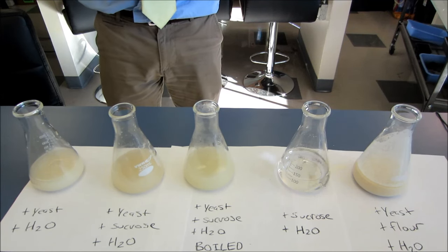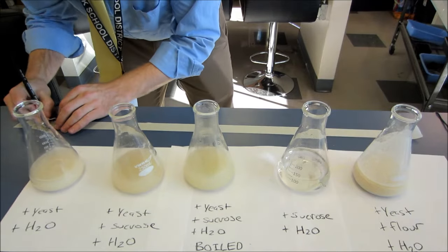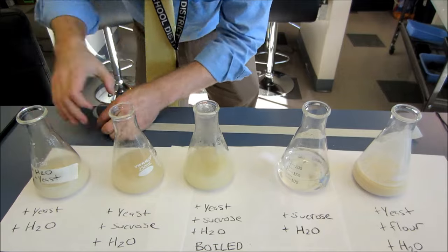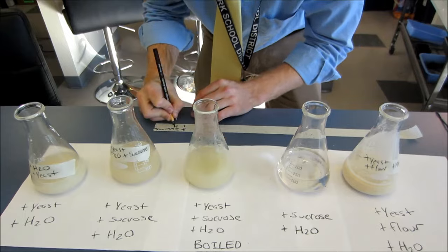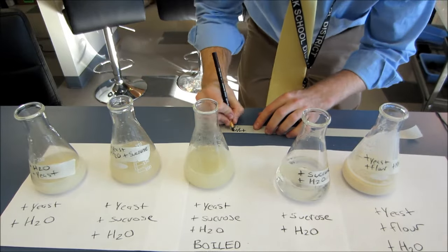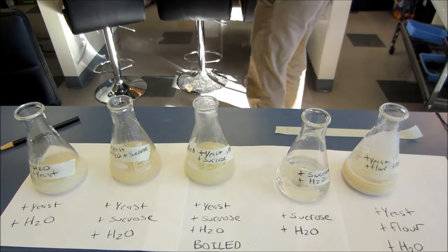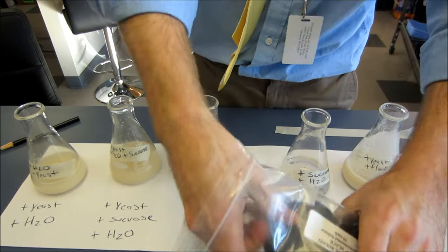Lastly though, we need some way of measuring how much gas is going to come out of these flasks. We need some way of measuring the fermentation. We could measure how much the sugar gets eaten, but I don't have any special ways of doing that. An easier way is just to measure how much carbon dioxide is created. There are many ways you can do that. We're going to use just balloons.